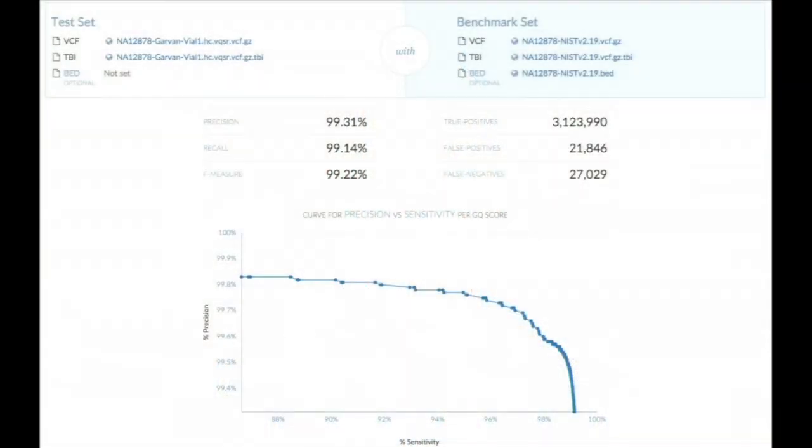In particular, you'll see that the comparison framework on PrecisionFDA gives you information such as the number of true positives, false positives, and false negatives, as well as statistics such as precision, recall, and F-measure. But comparisons aren't the only things one can do on PrecisionFDA.